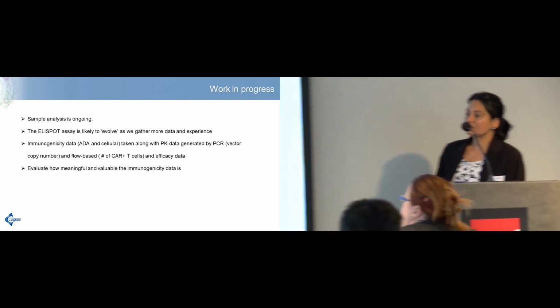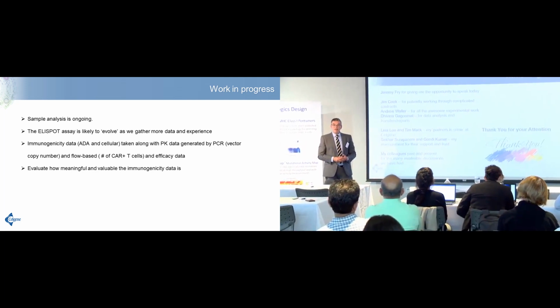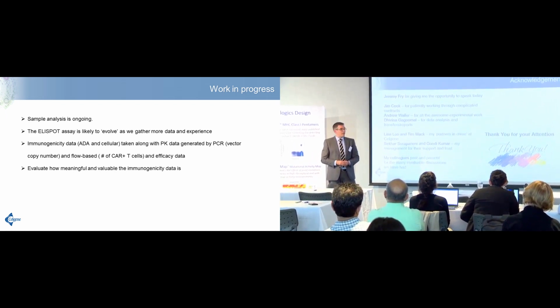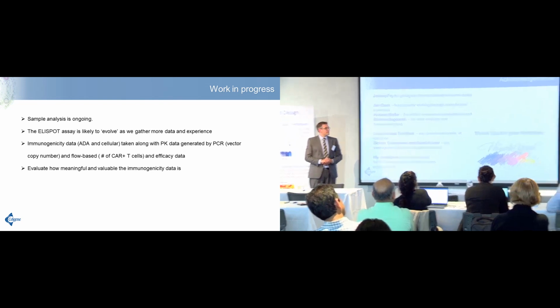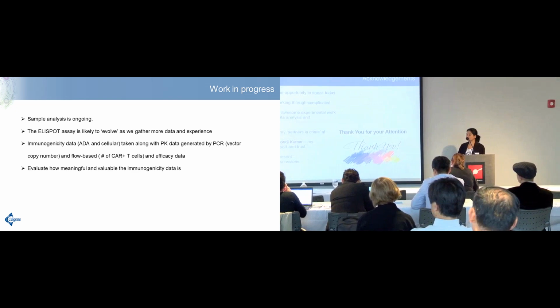And again, that's where the positive control donors are very, very valuable. So really, I think there's a matter of luck, if I'm honest with you, a little bit, with the fact that the quality of the peptides has been very good and we've had no issues at all with the background. That's something that, if it had shown up as a problem, is where we would have pointed to, I think. We had to go with it and see how it worked. We've done 2 different programs now with this assay, and both of them have worked pretty well.